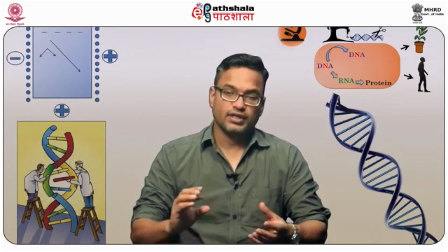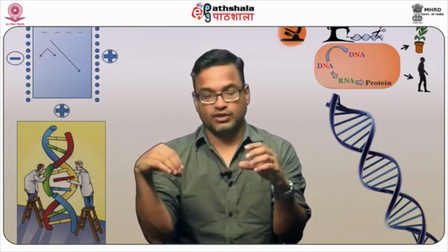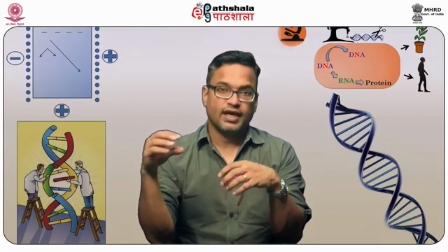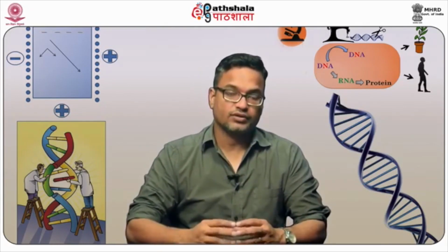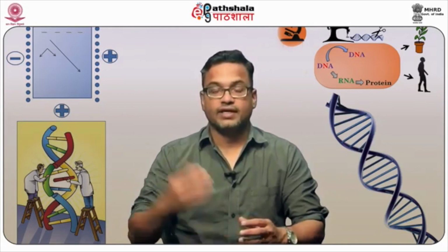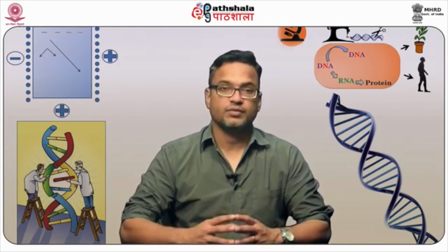Molecules which absorb energy will go to a higher energy state, remain there, and come back to a lower or ground state, and during that process they emit light. That's the window used by fluorescent based microscopy, because it captures that emitted light, and by that it can figure out where exactly that molecule is inside the cell or in the specimen one is looking at.